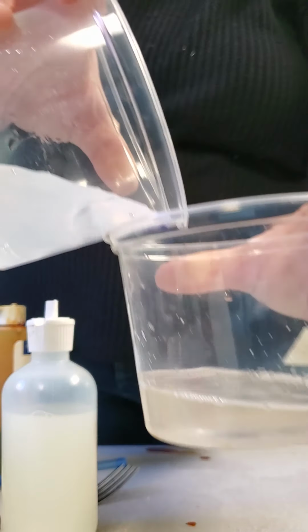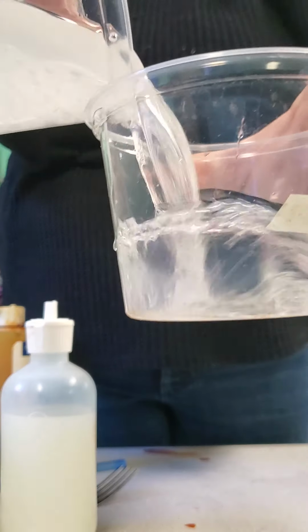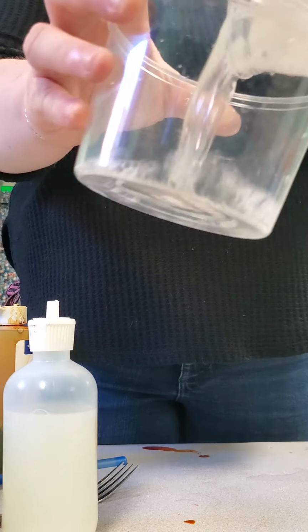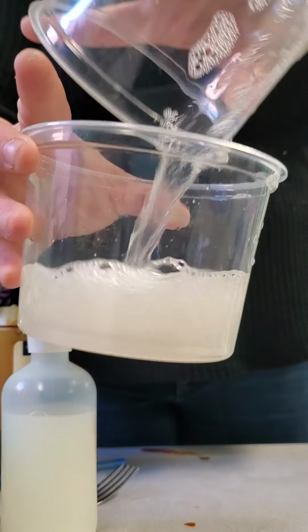1 and 2. Now I'm going to put my camera over here, so hopefully you're able to see what happens here. I'm going to take my 2 and I'm going to mix, mix, mix, mix. Sometimes it goes very quickly. Sometimes we need to wait.